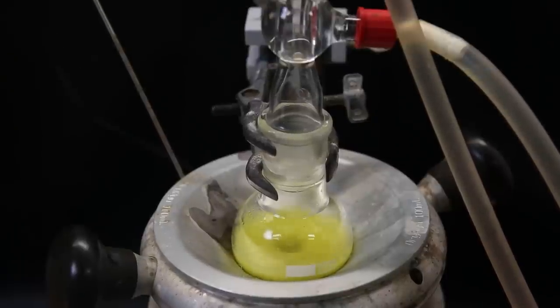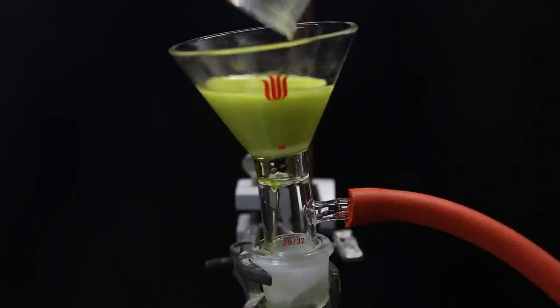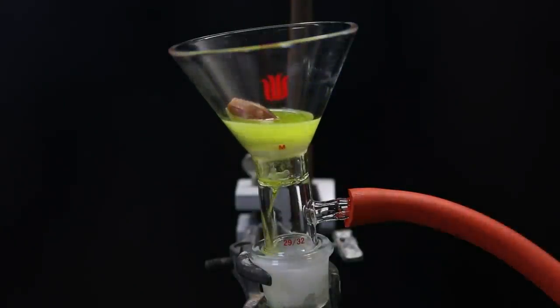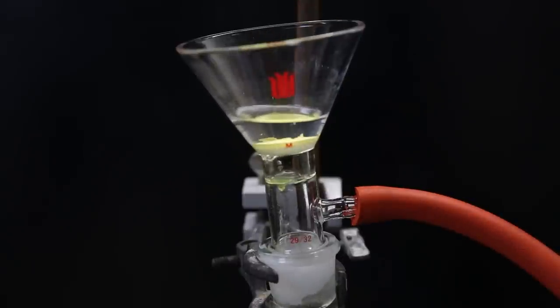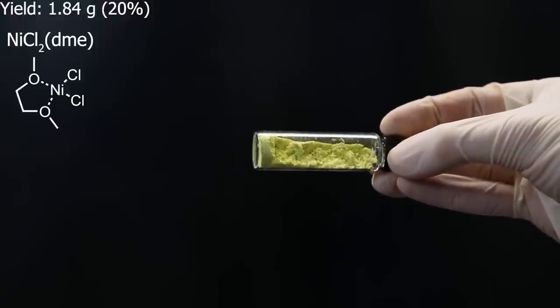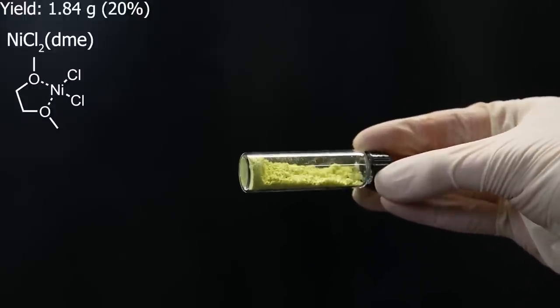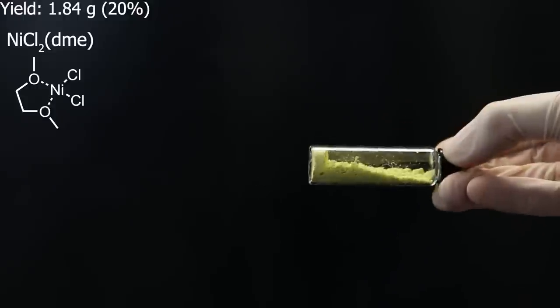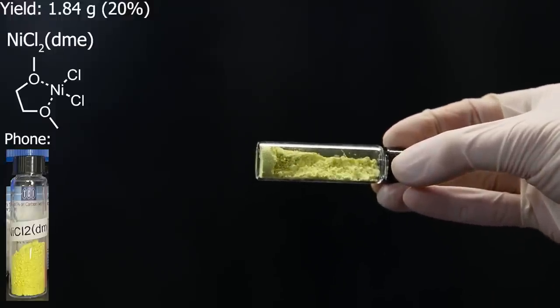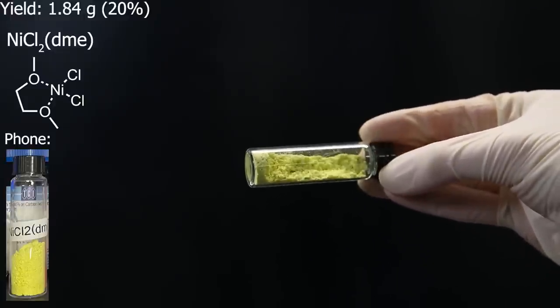I leave it to reflux for a day, and when I come back, it has a green-yellow color. I allow it to cool down and then filter it all through a glass-fritted funnel. I wash the residue with some pentane, and afterward I am left with 1.84 grams of nickel(II) chloride DME, which is a yield of 20%. I actually misread the procedure, and it should be done with triethyl orthoformate and not methyl, so I'm okay with this yield. It should be a yellow powder, which it is, but the camera somehow does a horrible job in picking it up in this light and makes it look more green. A picture from my phone gives a better representation of the color in real life.